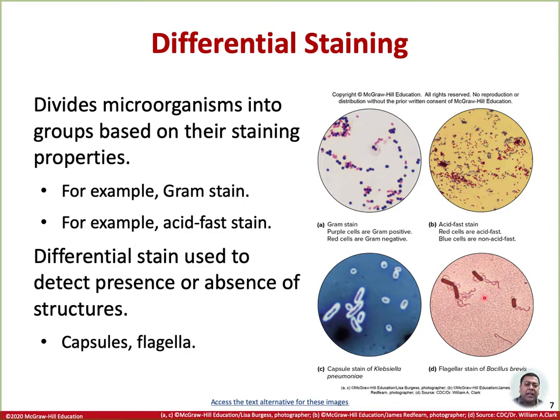Next is the flagella staining, and this provides taxonomically valuable information about the presence or distribution of the flagella on bacterial and archaeal cells. What we mean by that is that flagella are locomotory organs, fine thread-like organelles, and they can only be seen using an electron microscope, although bundles of flagella can sometimes be visualized by dark field microscopy.